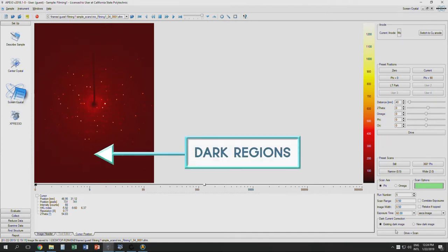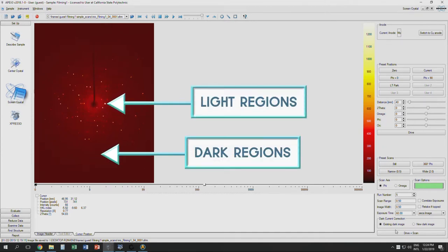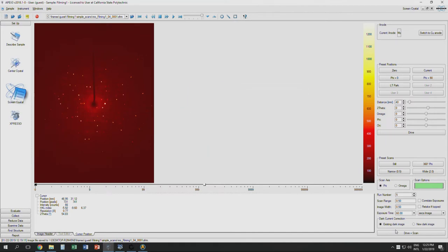The image displays dark regions and light regions. For organometallic and small molecule crystallography, these are typically chosen to be red or white or yellow, as in this example on the screen. For protein crystallography, the standard is a light gray background with dark gray spots.